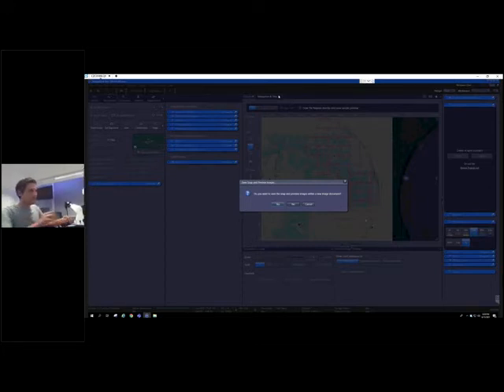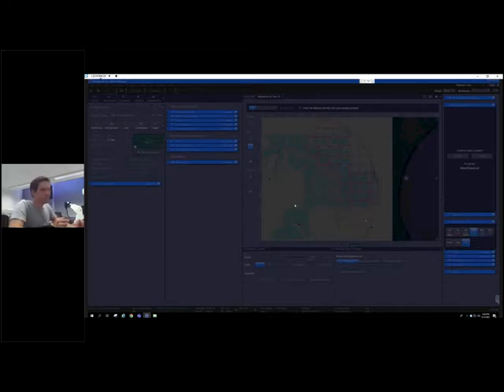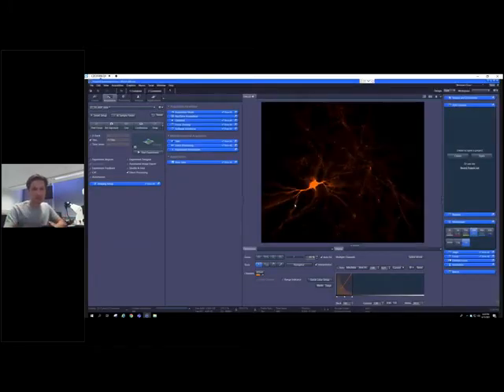All right, so now I've just added a 96 well plate holder into our microscope stage with a 96 well plate in it, which has a cover glass bottom and has some adherent cells on it. So it's U2OS cells.